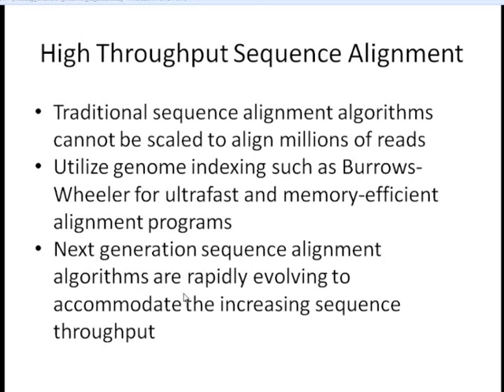This is a public service announcement: next-generation sequencing alignment algorithms are changing very quickly, and they're evolving to keep up with the rate at which sequence throughput is increasing. We'll go through some programs today, but I would highly suggest that you look into the literature and see which algorithms people are using at the time, because these ones may not be the most ideal in the future.